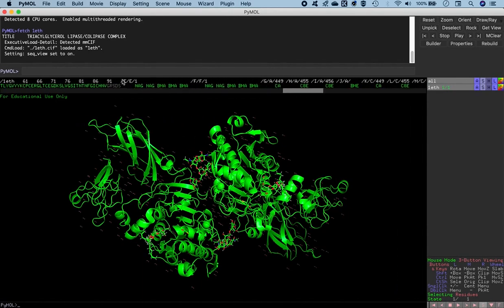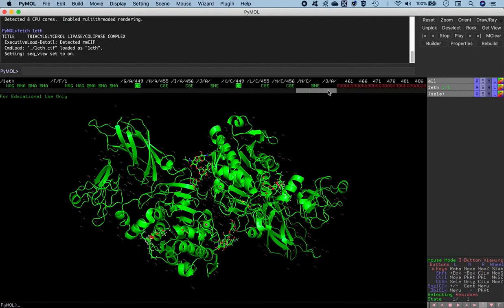And if you go down further, we find chain E, chain F. So these are all the ligands that we used in the structural characterization. And then you have some calcium ions as well, so you can annotate these calcium ions. We'll get rid of all of these because what we are concerned about is modeling the protein part only.